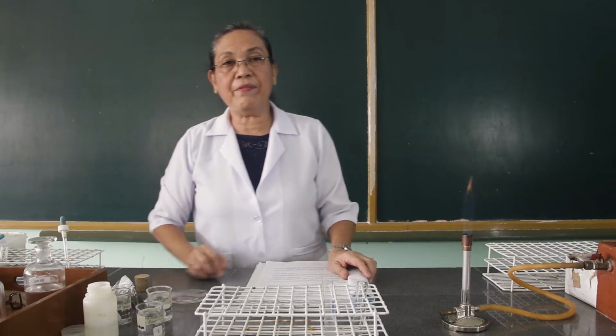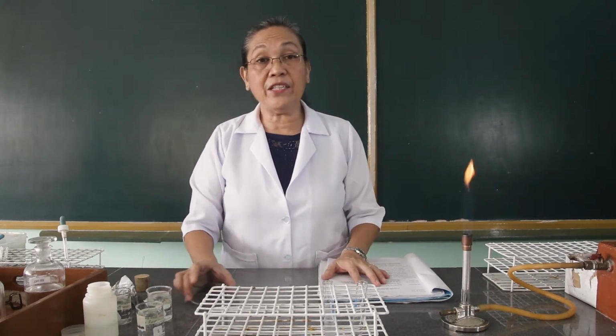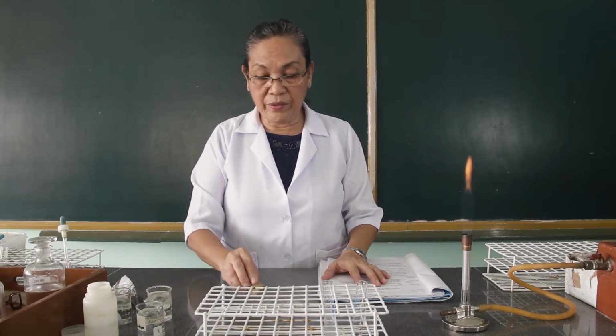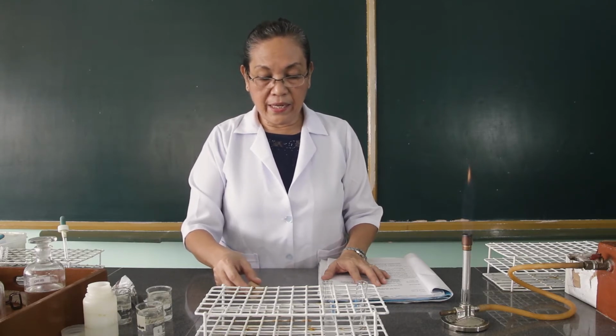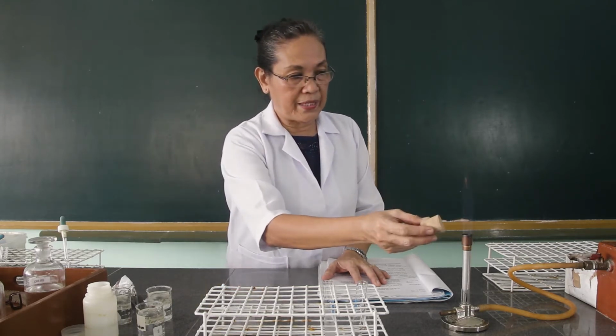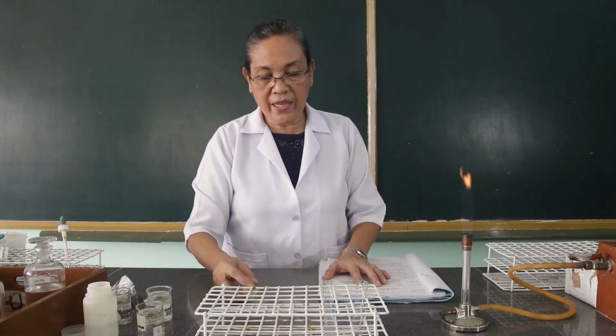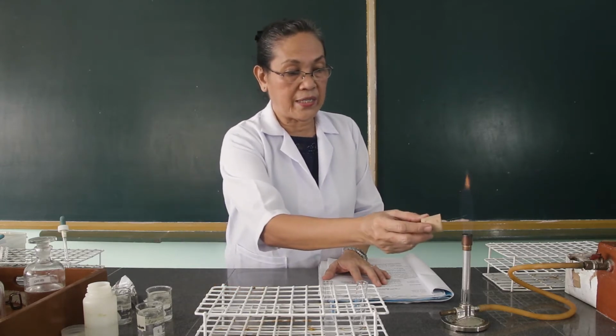Since we are going to have a flame test of the magnesium ion, we have again to clean our nichrome wire by dipping it into the hydrochloric acid and put it over the Bunsen flame until such time that the nichrome wire will not impart a different color aside from the flame.